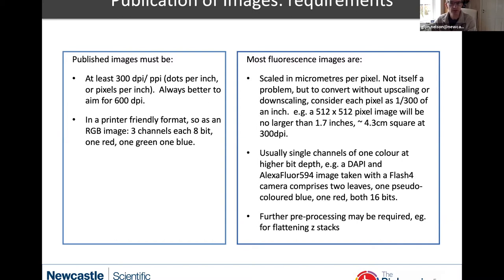There is also further pre-processing that may be required, such as if you have a Z-stack, you might need to flatten it or render it.